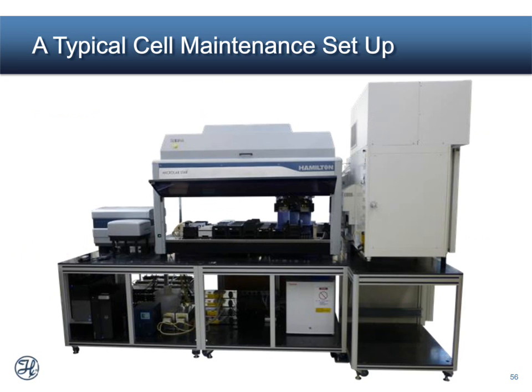So here's a picture of what a system typically would look like, an integrated cell culture system from Hamilton. You can see here on the right we have integrated incubators. This system supplies about 220 cell culture plates to the system liquid handling platform in batches, where the deck accessories that I mentioned earlier are situated so that we can handle passaging, media exchanges, cell suspension, etc. here underneath the pipetting platform.